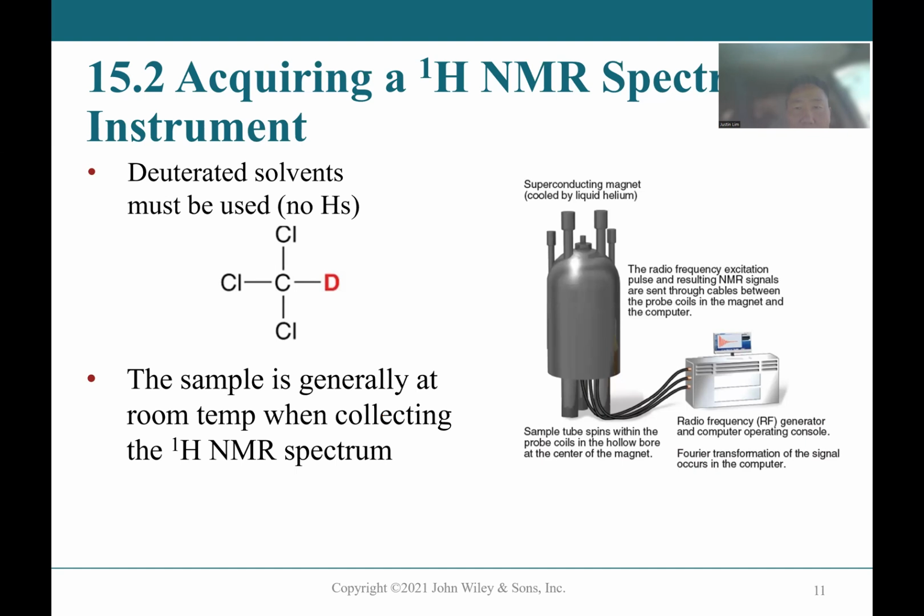This is an NMR instrument. We can use a deuterated solvent, so this one, CDCl3, is a standard solvent.